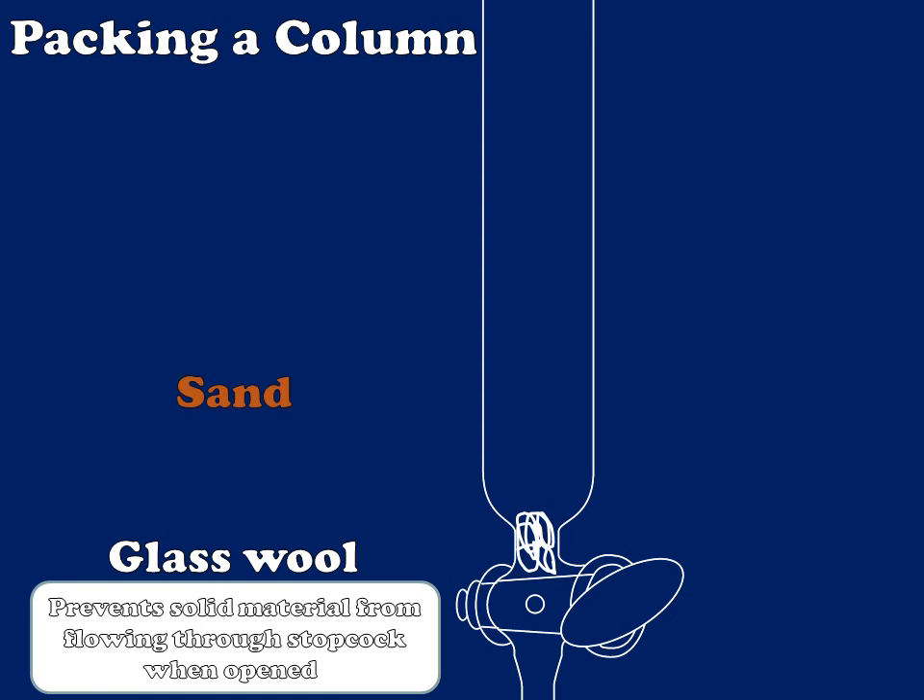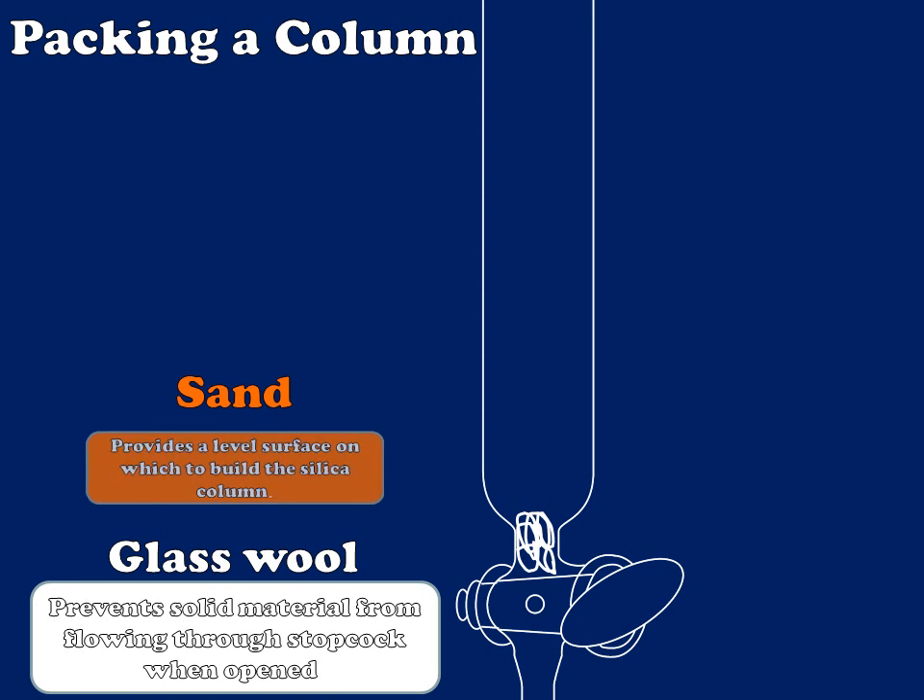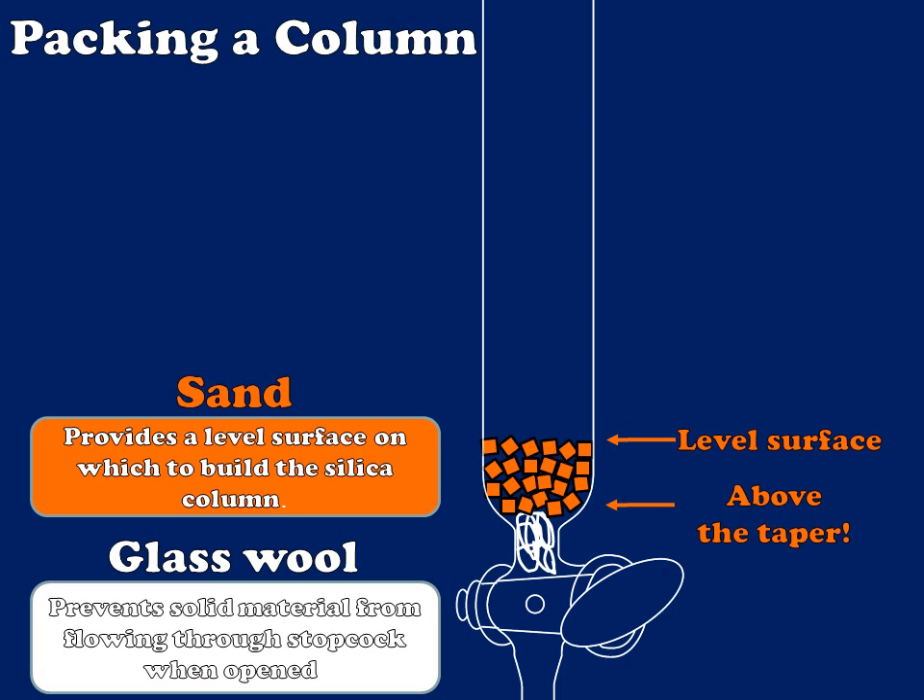The next component of my column is sand. I add sand so that I can provide a level surface onto which I can build my silica column. I'm going to put just enough sand in there that I can generate a level surface by agitating the column gently. I'm also going to be sure that I add enough sand that I'm beyond the taper of the column, so that my column will be of uniform width throughout.